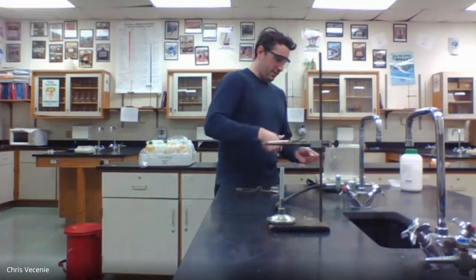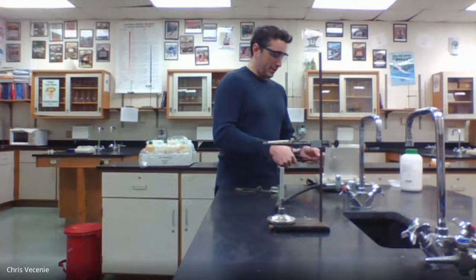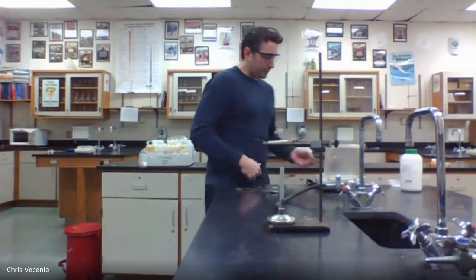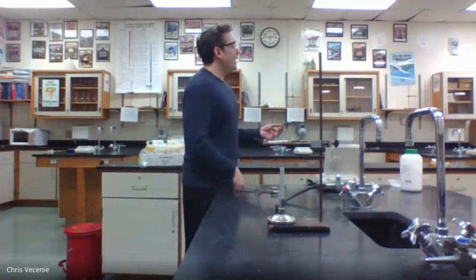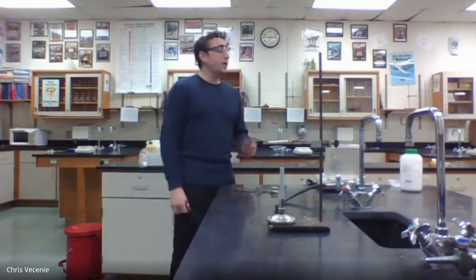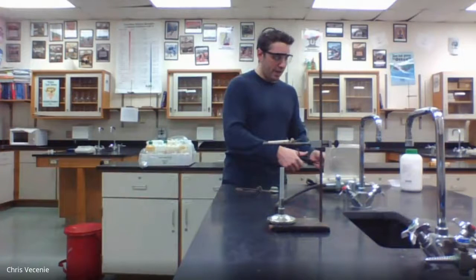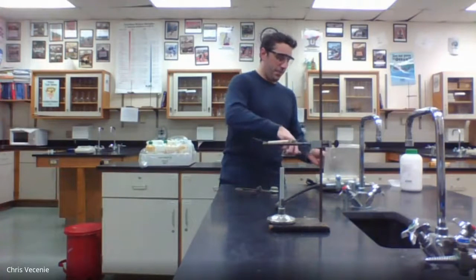Put this guy up here. Remember, my original mass of that guy was 2696. Now I'm clocking in at 2620. So I know some oxygen left. But like I said, 2620 is just the number I'm writing down on a little separate sheet of paper.